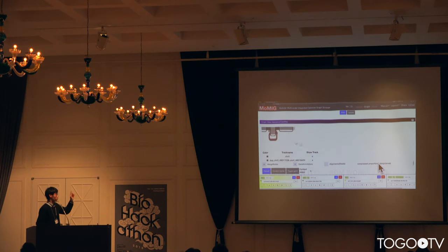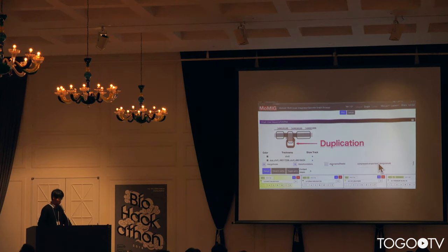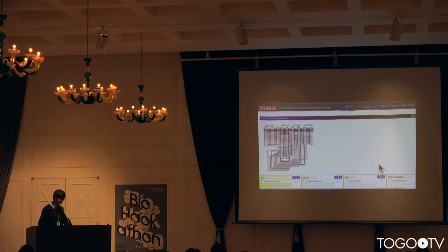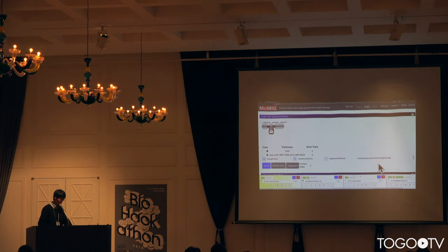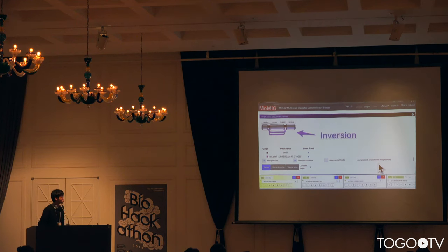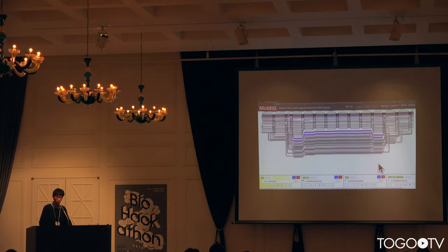The next example is duplication, which is also supported by looped read alignments. The last one is an inversion — inversion is shown the same way. All pictures excluding the captions are automatically generated by Momiji from SVDF.